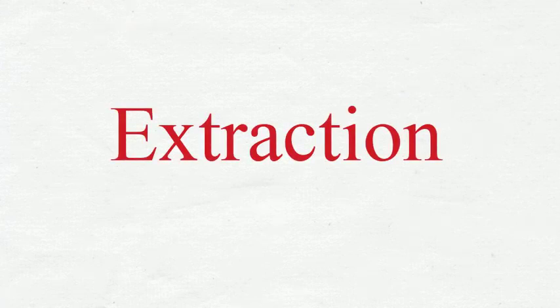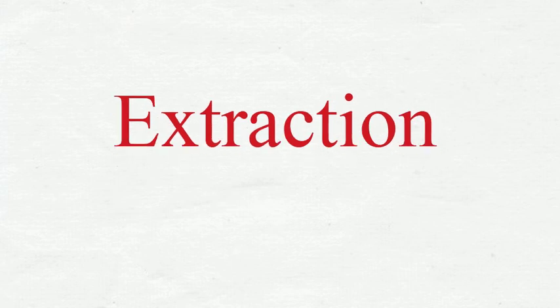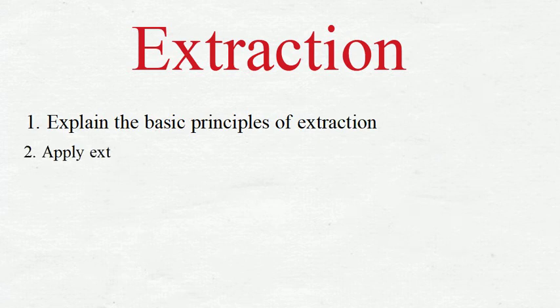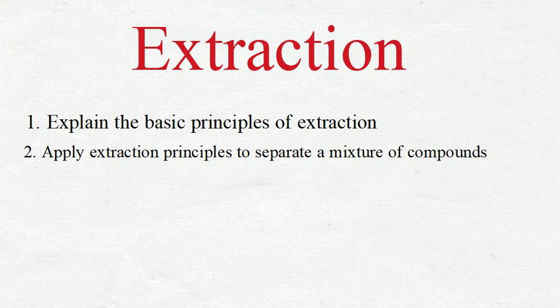In this video, we're going to talk about extraction. By the end of this video, you should be able to explain the basic principles of extraction as a separation method in a chemistry lab, and apply extraction principles to separate a mixture of compounds in a chemical reaction.